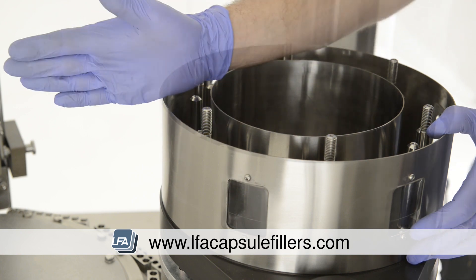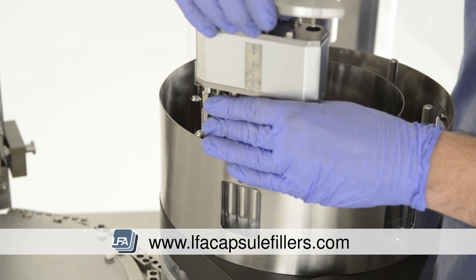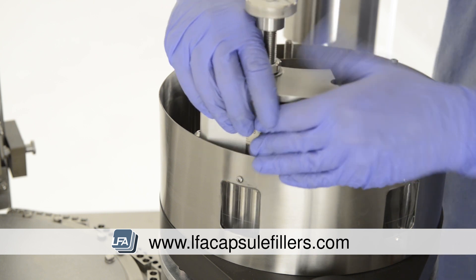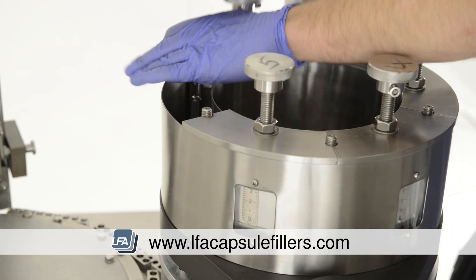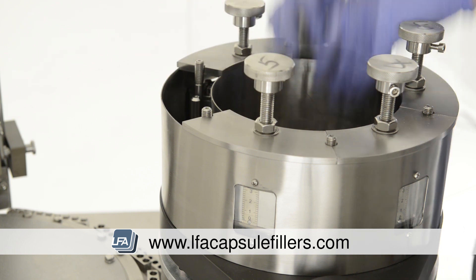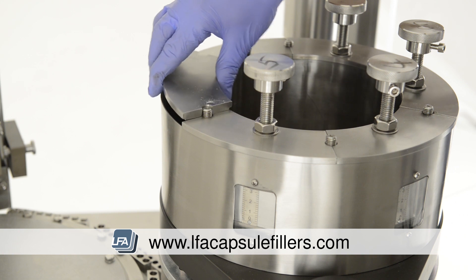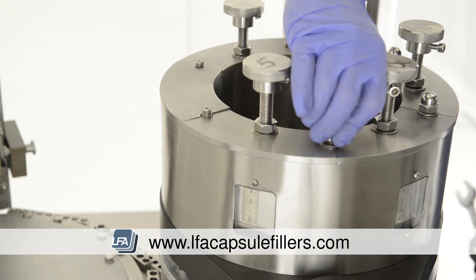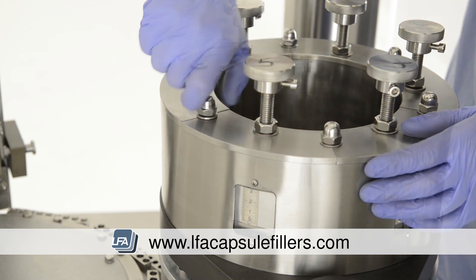Now we're replacing the tamping tools into the positions they were originally removed from. Ensure you're being careful with the tips of the tamping tools as they're fragile. Next, replace the washers and nuts on the very top section to secure the tamping tools into place. Tighten the 17mm nuts on top equally in small increments.